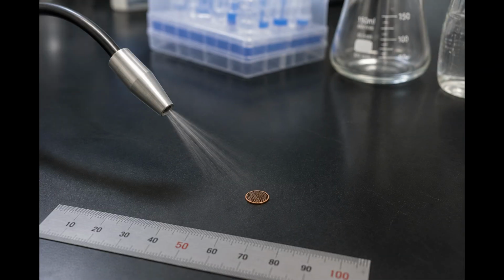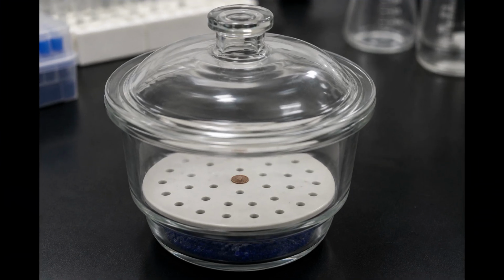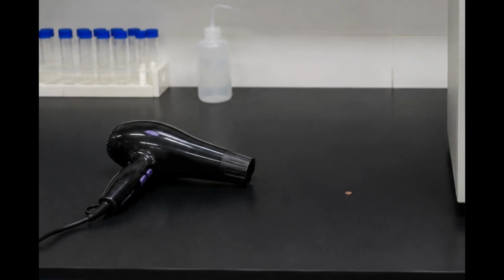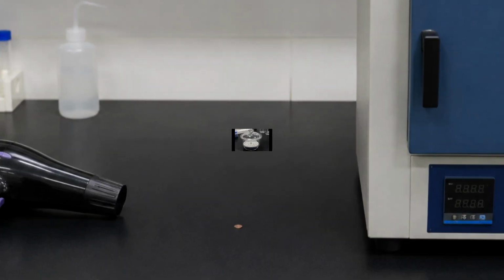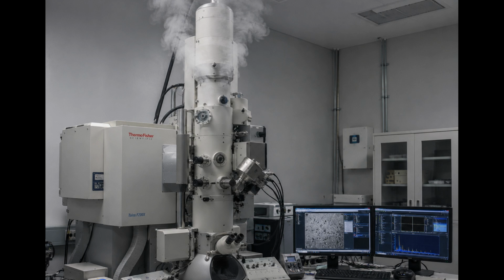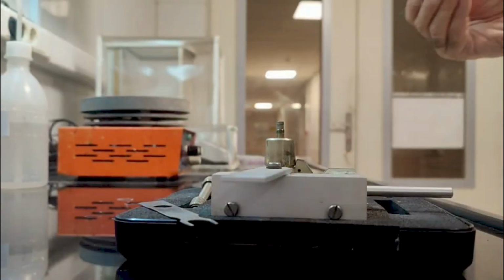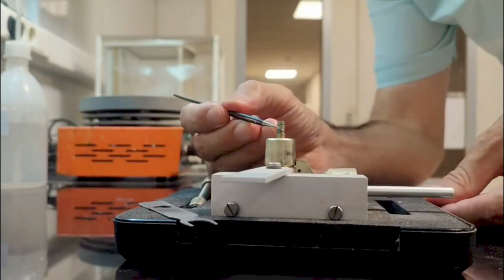grid. Allow it to air dry in a dust-free environment, preferably a clean bench or a desiccator. I strongly advise against using ovens or external dryers, as they can induce unwanted reactions or surface defects in sensitive samples. Furthermore, ensure the grid is thoroughly dried. Residual dispersant can outgas inside the TEM, compromising the column's vacuum and potentially contaminating the system. Finally, mount your dried grid into the TEM specimen holder, and you are ready for imaging.